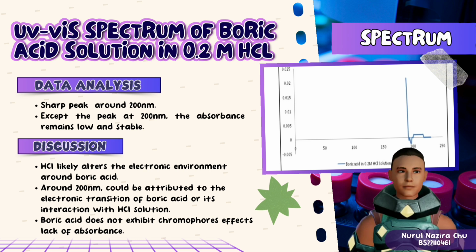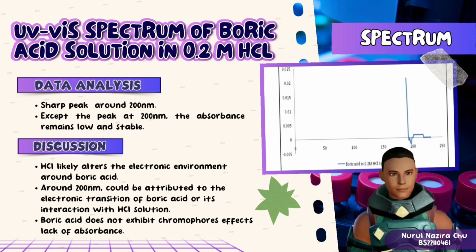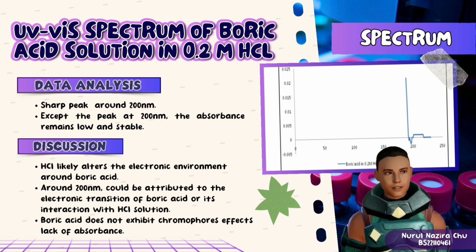The spectrum indicates a sharp peak around 200 nm. This peak suggests the presence of a significant absorbance within the ultraviolet range due to electronic transitions associated with the boric acid molecule when dissolved in the acidic medium.